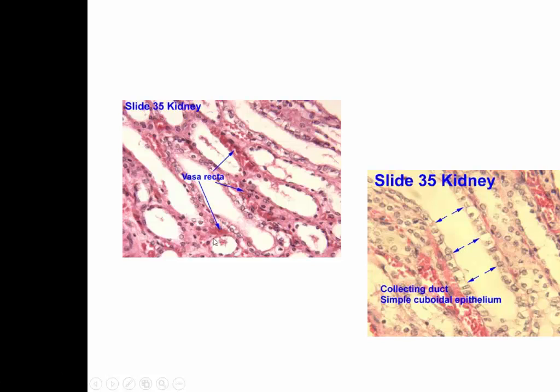So as far as knowing the tissue slides of the vasa recta, you don't have to know that, but that's what this is showing. But here's, again, loop of Henle, these long segments here. And here's a collecting duct, and I know it's a collecting duct because, again, look at the wall. Simple cuboidal cells, look at the size of it, very large space, because we know the collecting duct is the biggest portion of this coming off of the nephron.